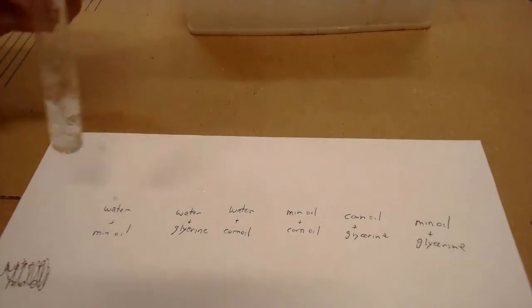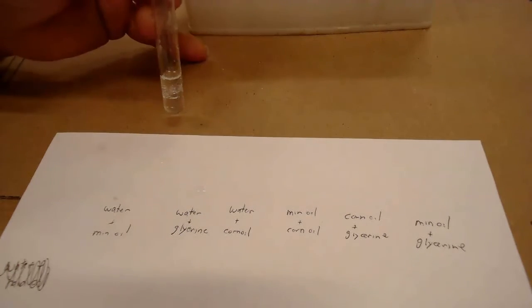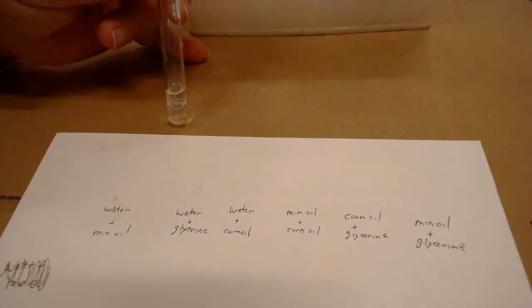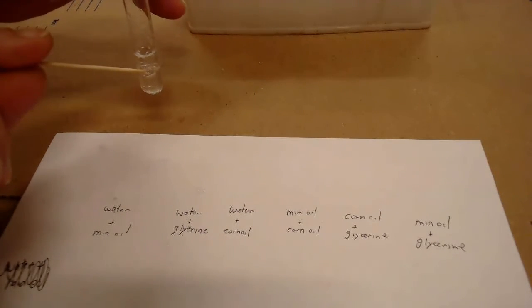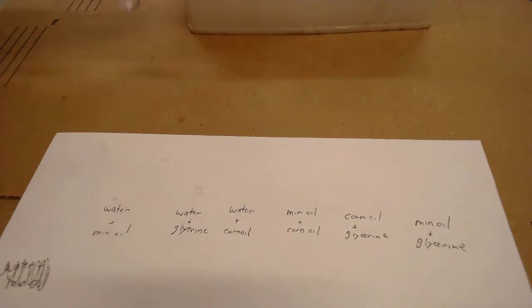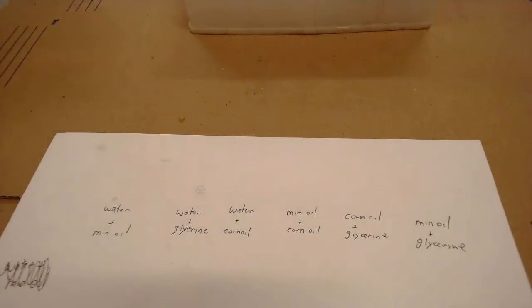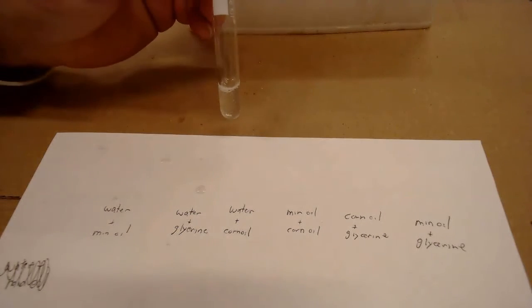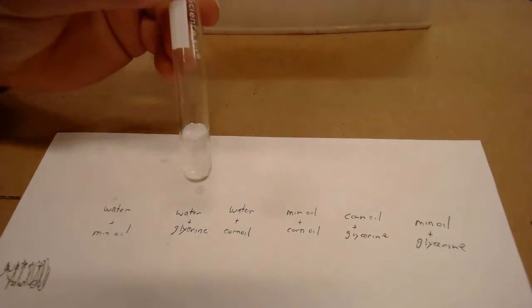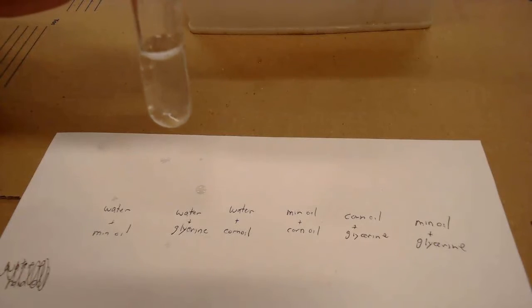For our first tube, we shake it up. Right away you can see a separating line — you can see two layers. They do not mix. Mineral oil and water do not mix — they're immiscible. The second one is glycerin. If you give it a little bit of a shake and look closely, there's no line there. The water and the glycerin actually mix together.